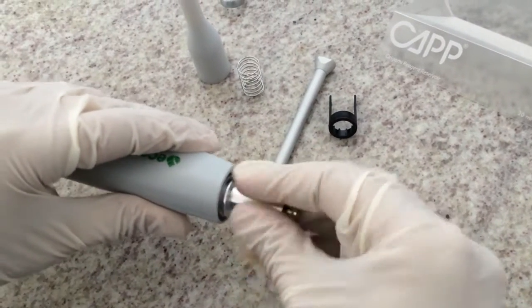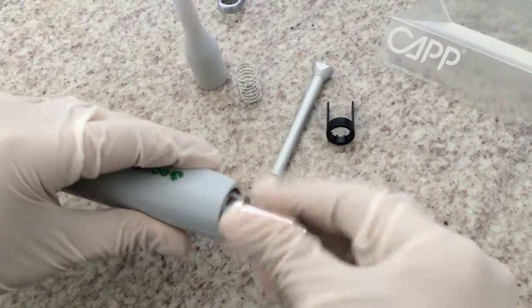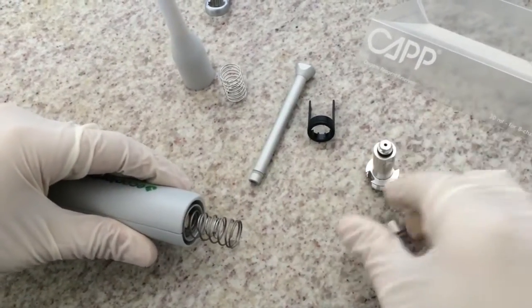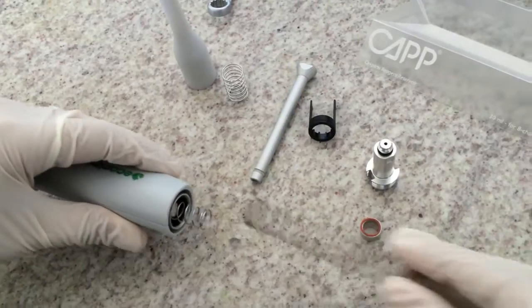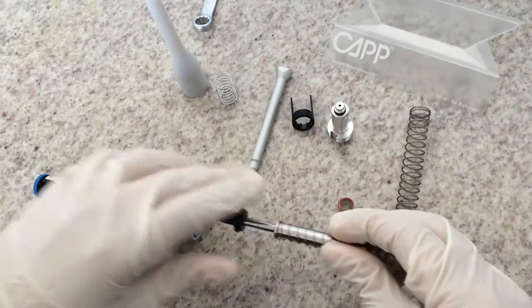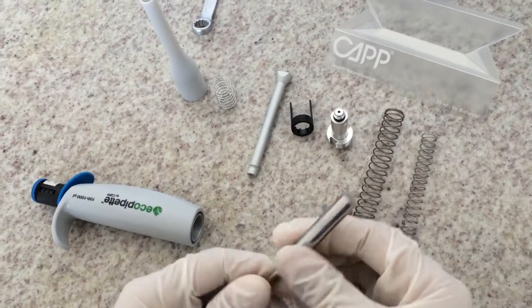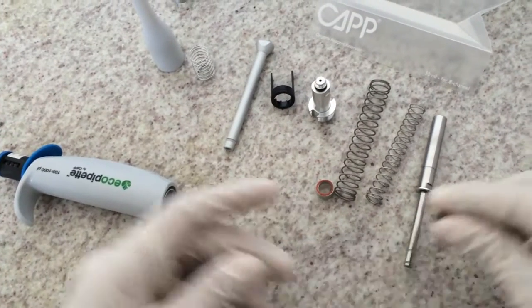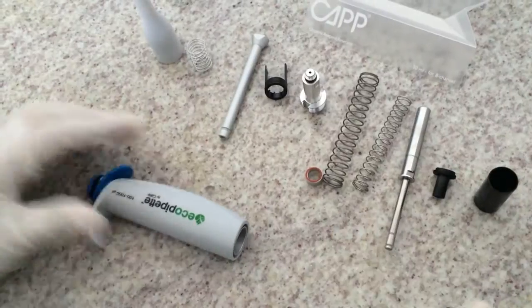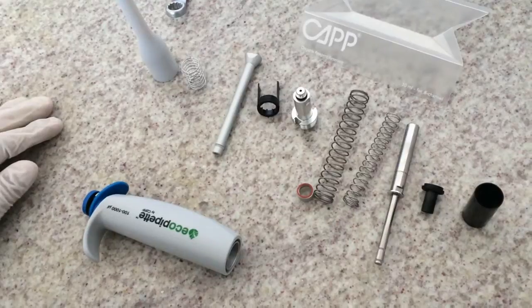We will then access the seal, o-ring and piston of the pipette. These can be replaced or cleaned and lubricated depending on their condition.